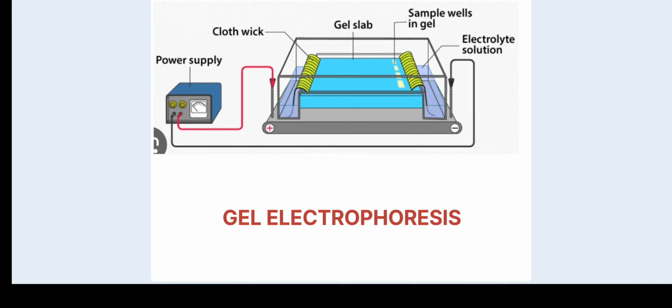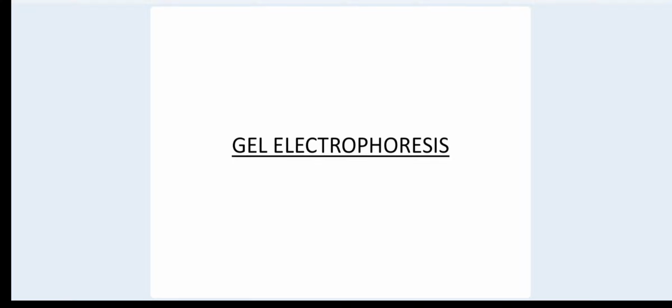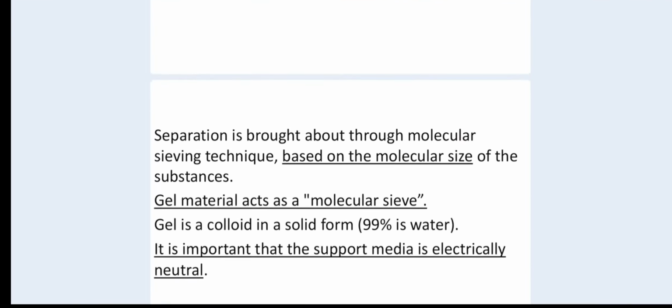Electrophoresis is broadly classified into free electrophoresis and zone electrophoresis. In the case of free electrophoresis, or electrophoresis without stabilizing media, the separation of charged particles takes place without a stabilizing or supporting media. But in zone electrophoresis, a stabilizing media like agar, starch or polyacrylamide is mainly used.